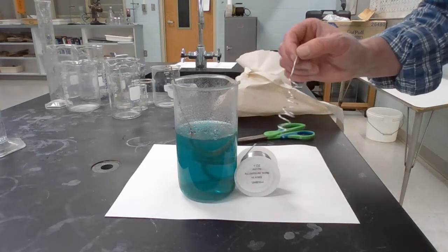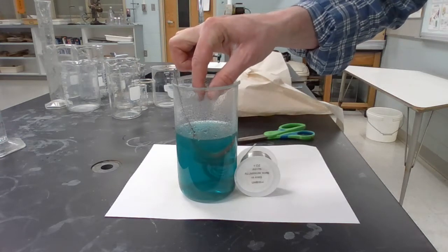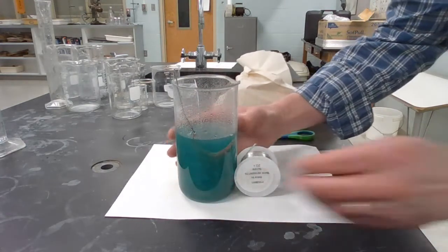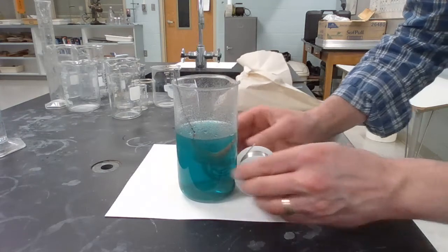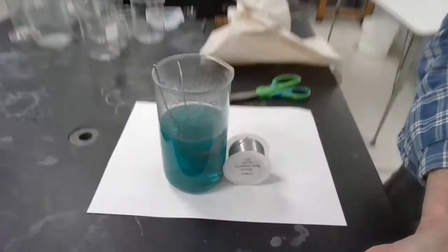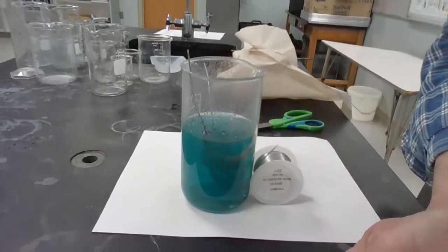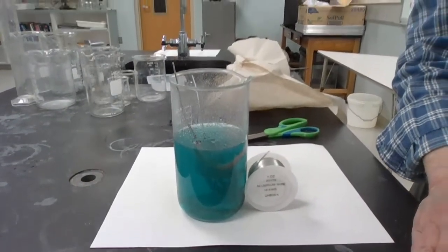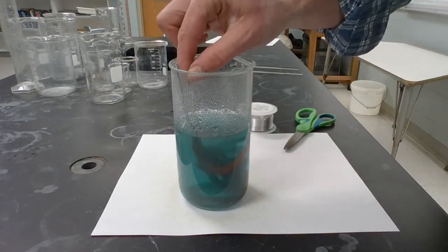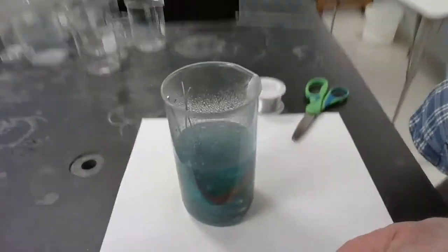Kind of feel like it's taking too long, so I'm going to add a little aluminum wire, see if I can make it go a little faster. It's definitely exothermic. This feels pretty hot right now. So it's giving off heat as it reacts. We can see that extra aluminum's making it bubble even more. All right, maybe a little more aluminum wire. I'm getting impatient. Still bubbling quite a bit.